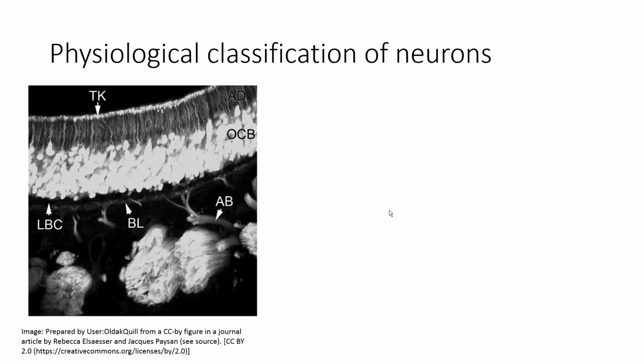This image is a confocal micrograph of the nasal mucosa. And up in here, we can see those are the cell bodies here. These are the dendrites coming into the cell, and you can't hardly make out, but there are axons back behind all of this fluorescent signal that are coming out here. So these are sensory neurons, meaning that they are bringing information about the external environment into the central nervous system.